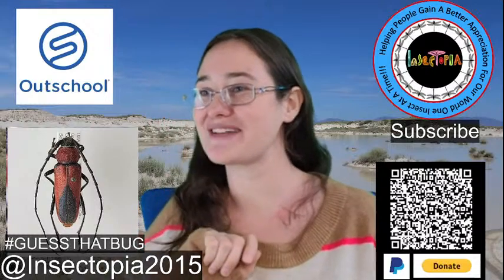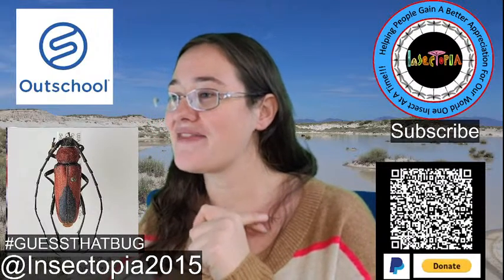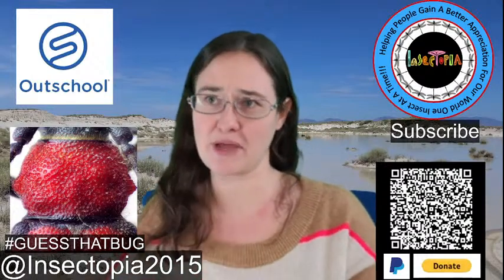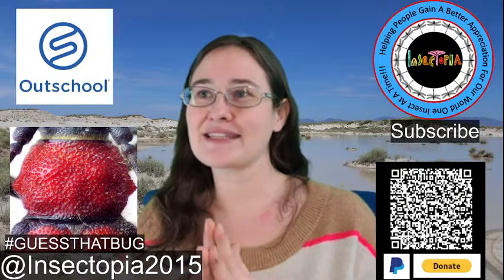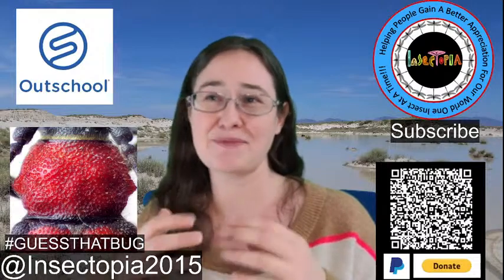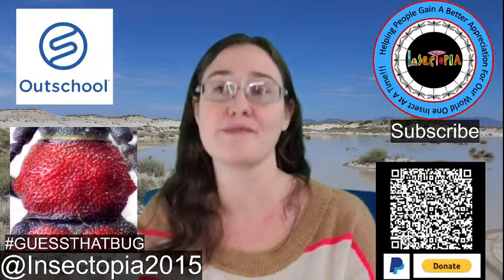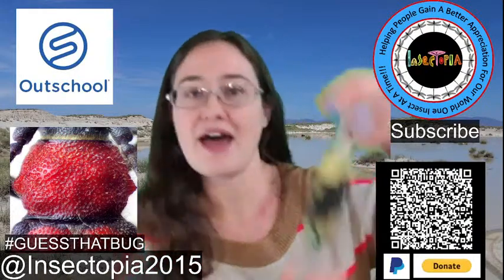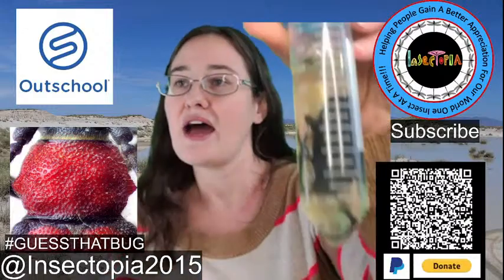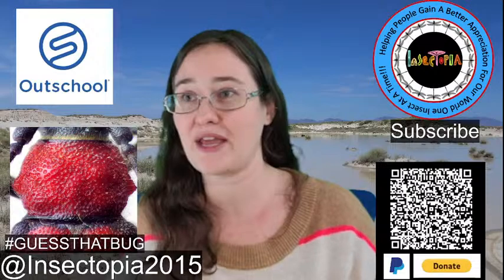Okay, I have one more question before we get to the end. And that is, how do I euthanize my insects? Now, it depends on the specimen that we're working with. Things that are hard-bodied, like beetles and a lot of times wasps and flies, a lot of those types of insects, I like to put directly into alcohol to bring home, and then I'll pull them out of alcohol to pin them. So, like, this is a longhorn beetle that I collected that is in ethanol that still needs to get pinned. This guy's been in here for a handful of years, but I haven't had a problem with pinning right out of alcohol.